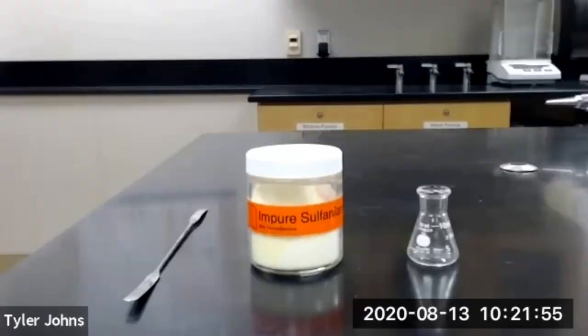In part A of this experiment, we will be performing a semi-microscale crystallization of impure sulfanilamide using an Erlenmeyer flask and a Hirsch funnel.